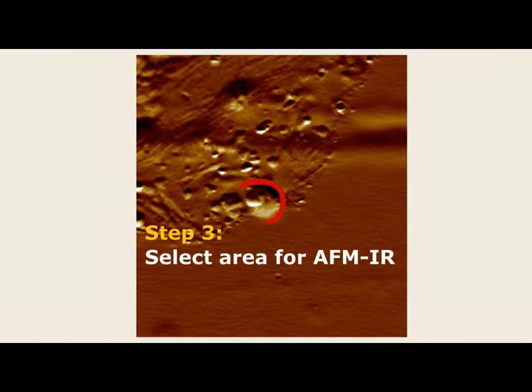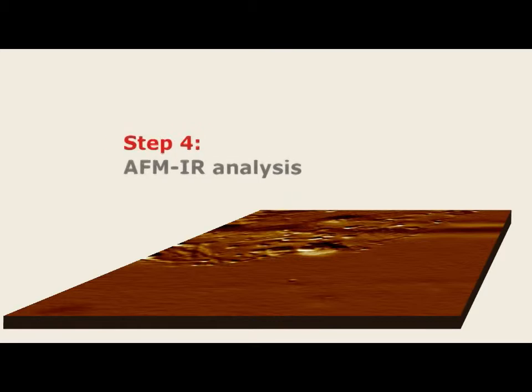Then we can select any location in the AFM image and arrange to perform the IR analysis, the chemical analysis.